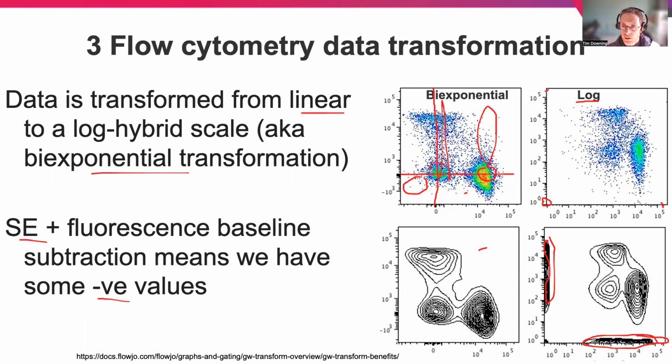And you see here we have a lot of values associated with being negative for both items on this plot, as well as ones that are clearly positive for this x-axis item, and those on the y-axis that are also positive for that item only, and few really that are positive for both in this quadrant up here. So if we have this plot, we can see the same sort of pattern of the 4 major clusters. It's just that a lot of space is taken up by the ones down here that have very small levels. So it's just a different way of representing our data, and therefore we should be conscious of what that's actually doing to our data.